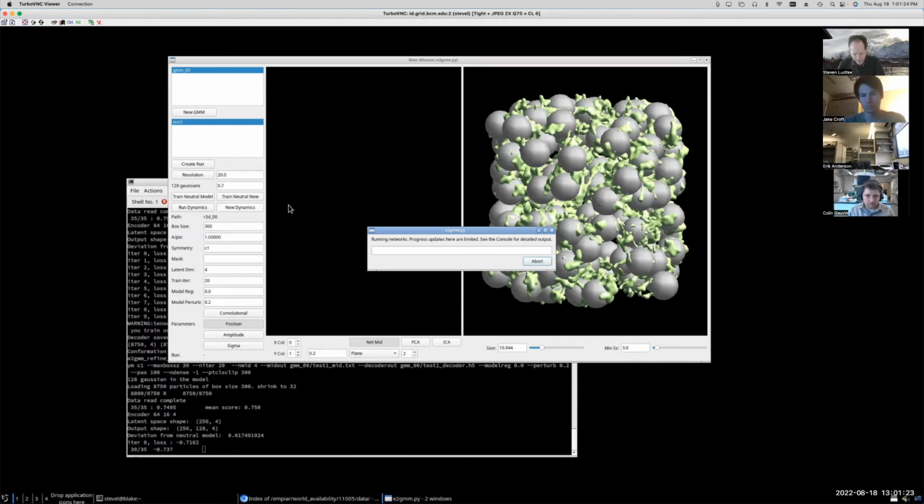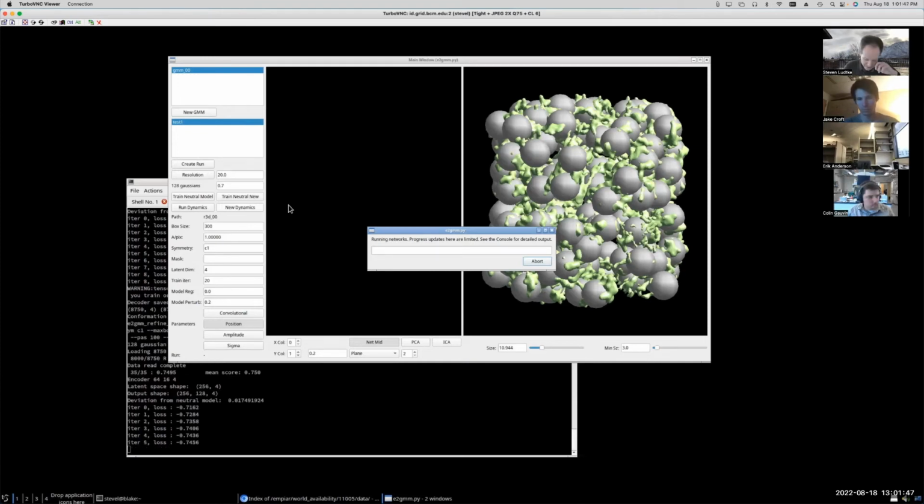It is kind of amusing, though, that the reason it tends to fail is because the data is too good. I'm not saying it always works on real data, but it won't have this kind of failure on real data.